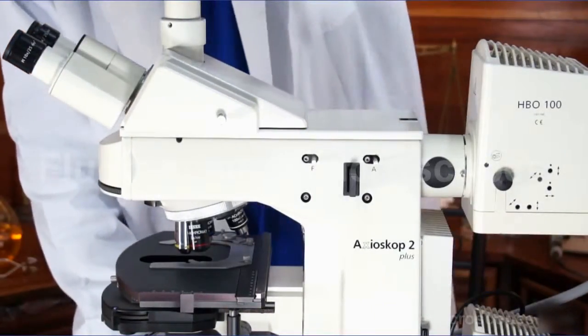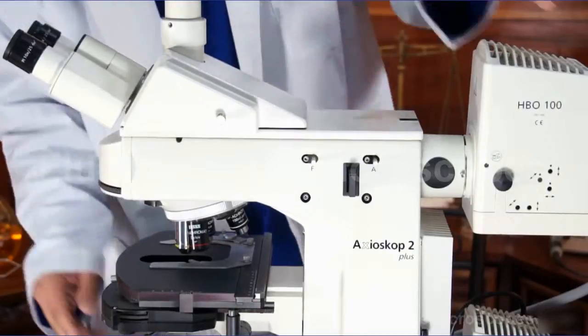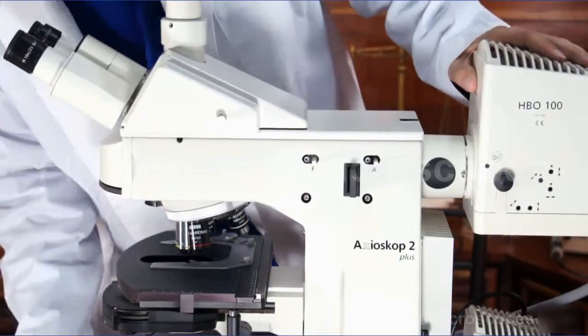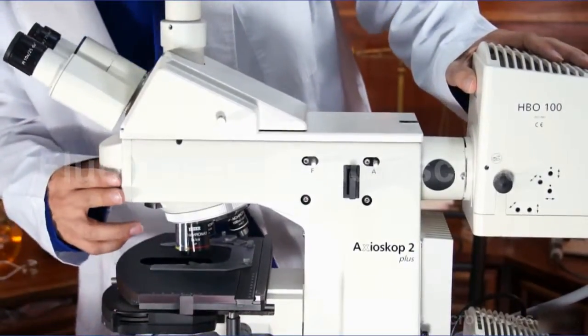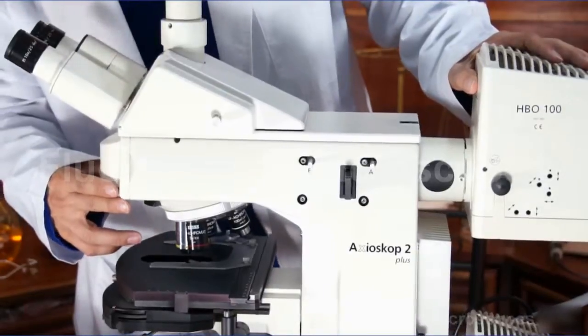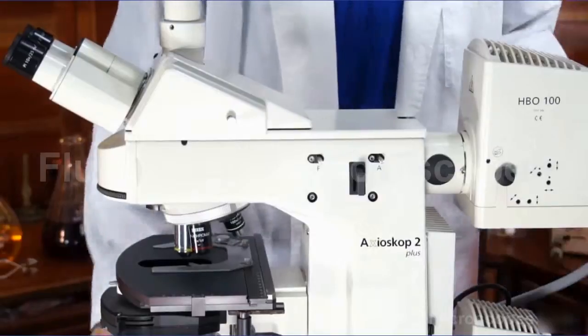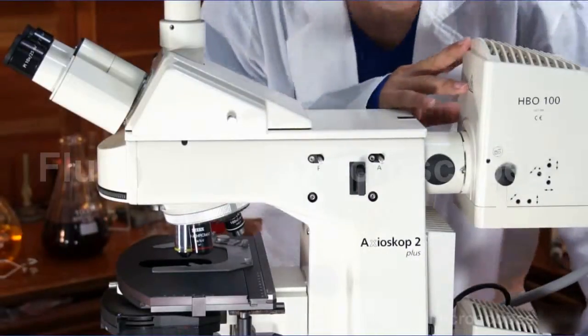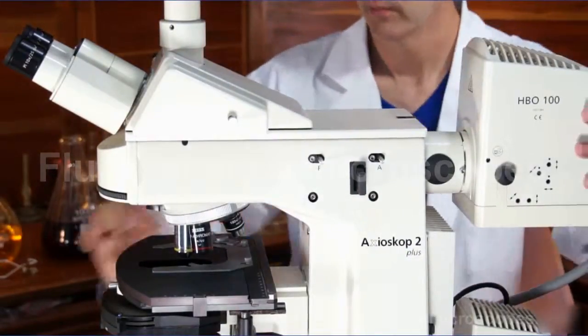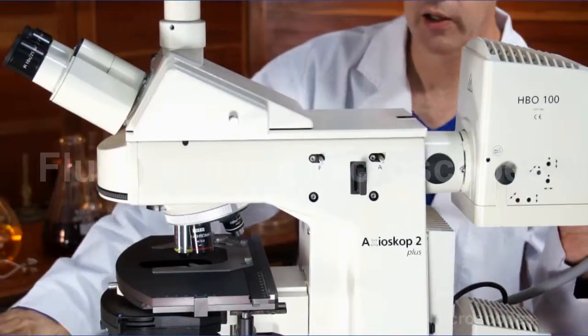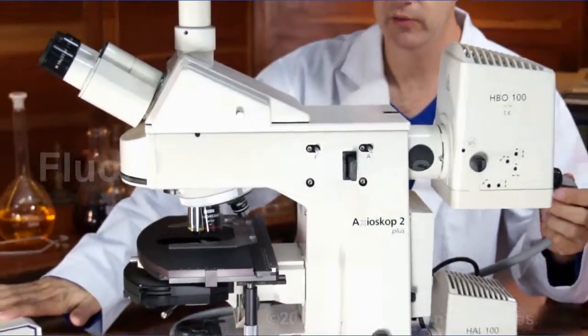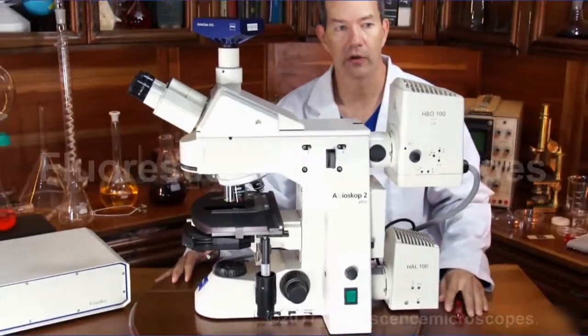If you need any other configuration on this microscope, different objectives, different filter cubes, if you need phase contrast, DIC, if you wanted to change out the mercury system to an Excite, for example, metal halide system, we can do all those things for you. Just let us know.